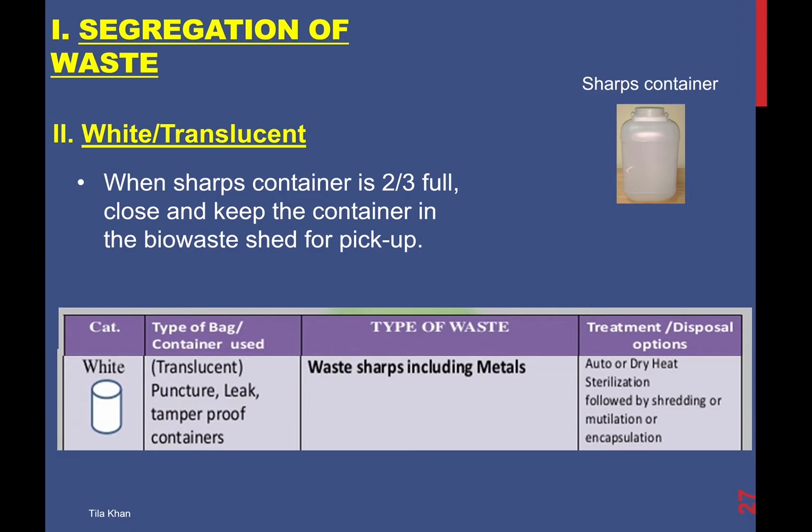Please remember that when the sharps container is almost two-thirds full, close the container and keep it in the bio-waste shed for pickup. Sharps are disposed of by sterilization first, by autoclave or dry heat sterilization, followed by shredding or mutilation or encapsulation in the final disposal site.